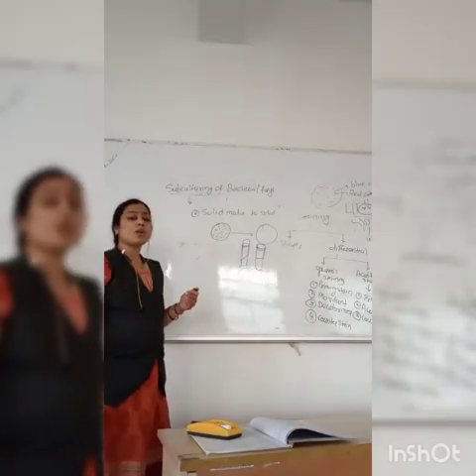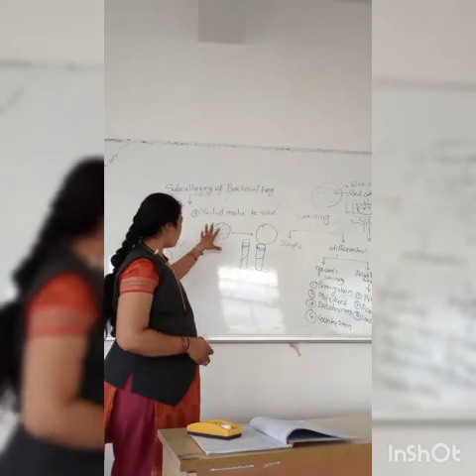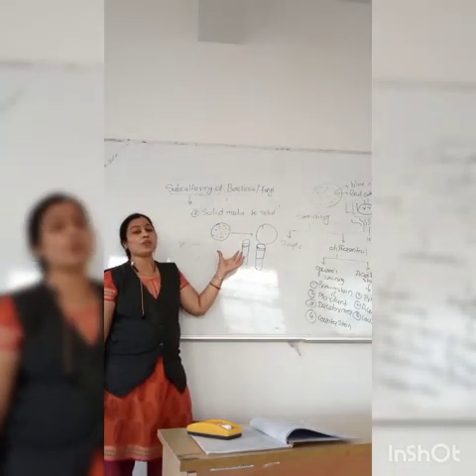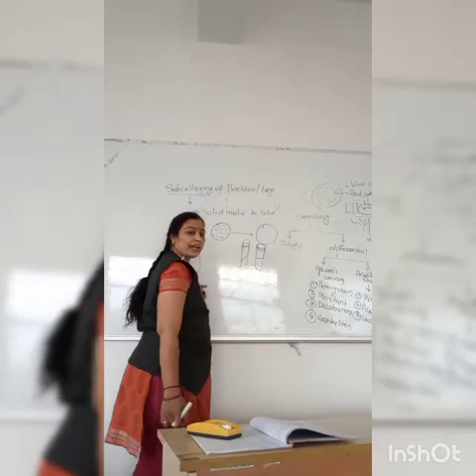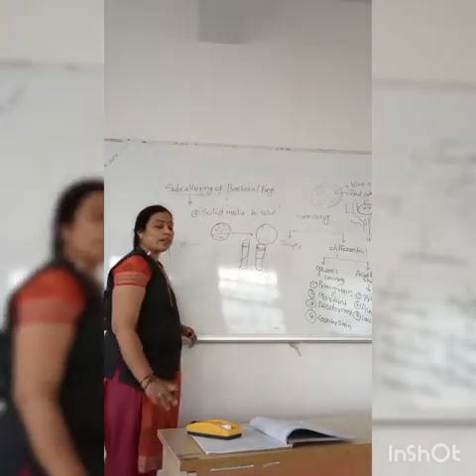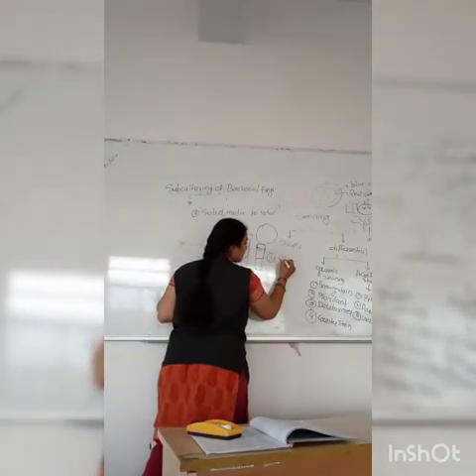So how do you prepare this subculture? First, a fully grown culture is necessary. If you have the fully grown culture, you transfer it onto a nutrient agar plate or slant. If it is a nutrient agar plate, then you follow the streak plate method.